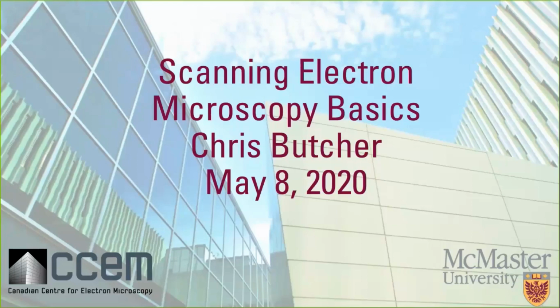Are you ready, Chris? Yep, let's get started. So my name's Chris Butcher. Today we're going to be talking about scanning electron microscopy. This can be viewed as sort of an introduction to the subject. I'm one of the technical staff at the Canadian Centre for Electron Microscopy. I have 35 years of experience with SEM and also a lot of experience in sample preparation for both SEM and TEM, as well as extensive experience with EDS and EBSD.